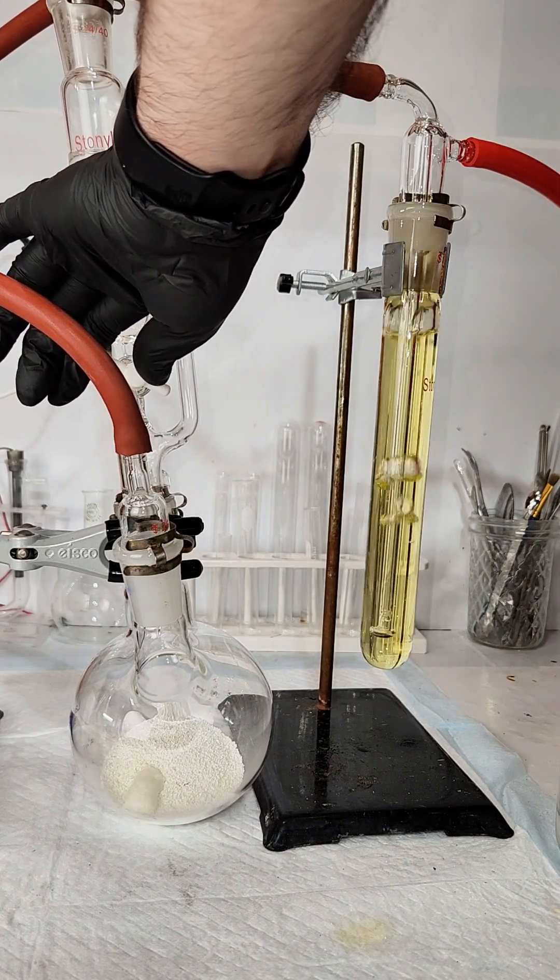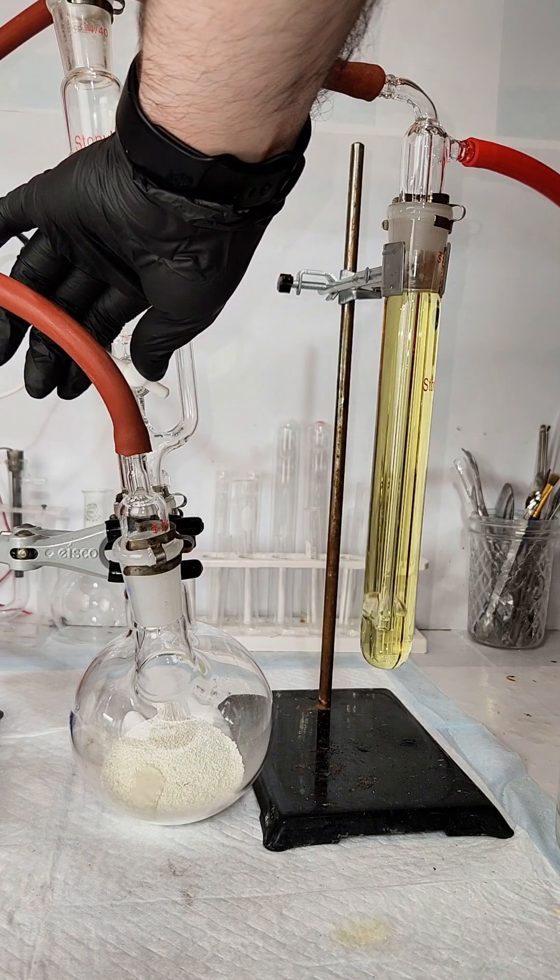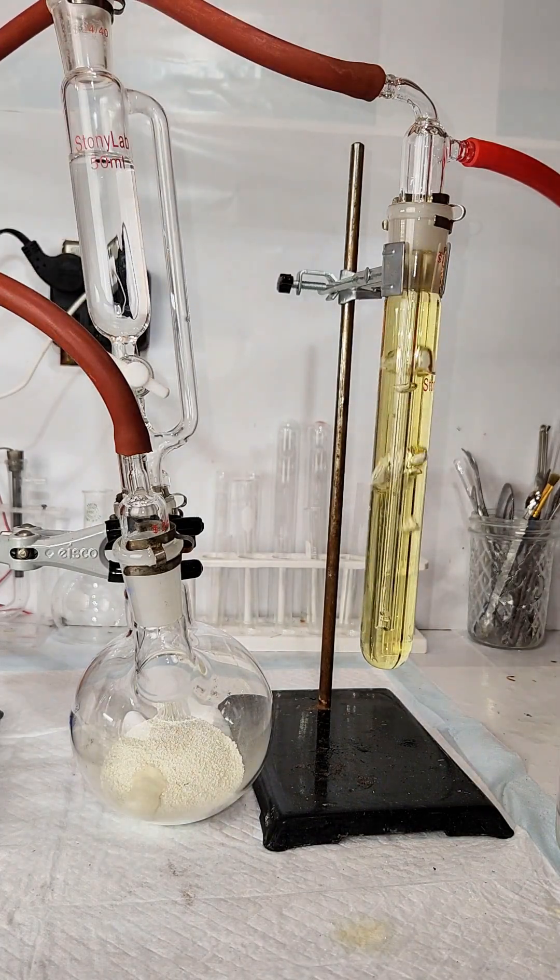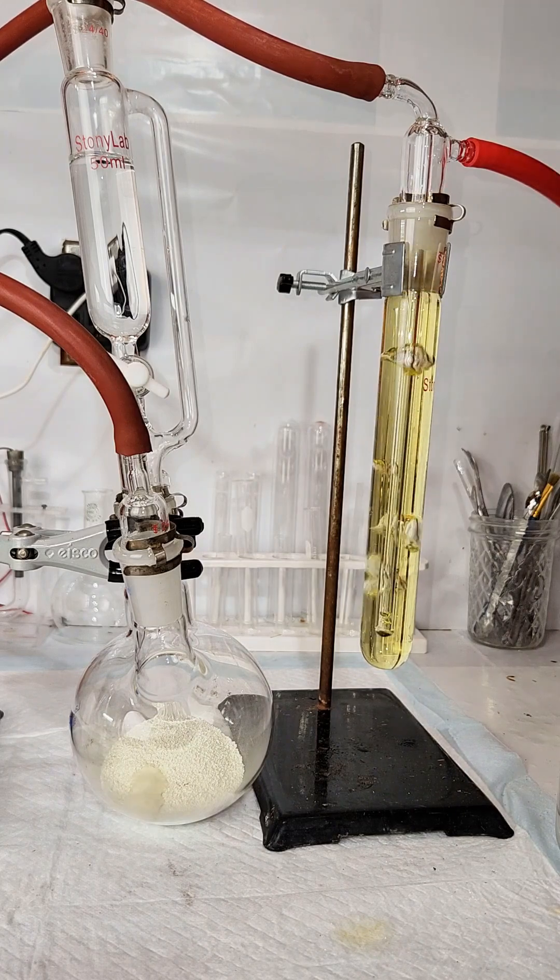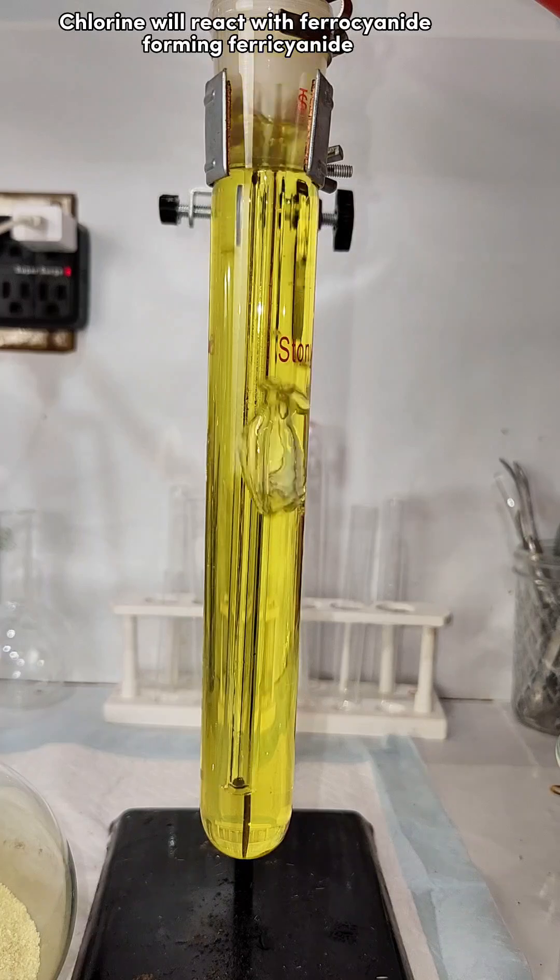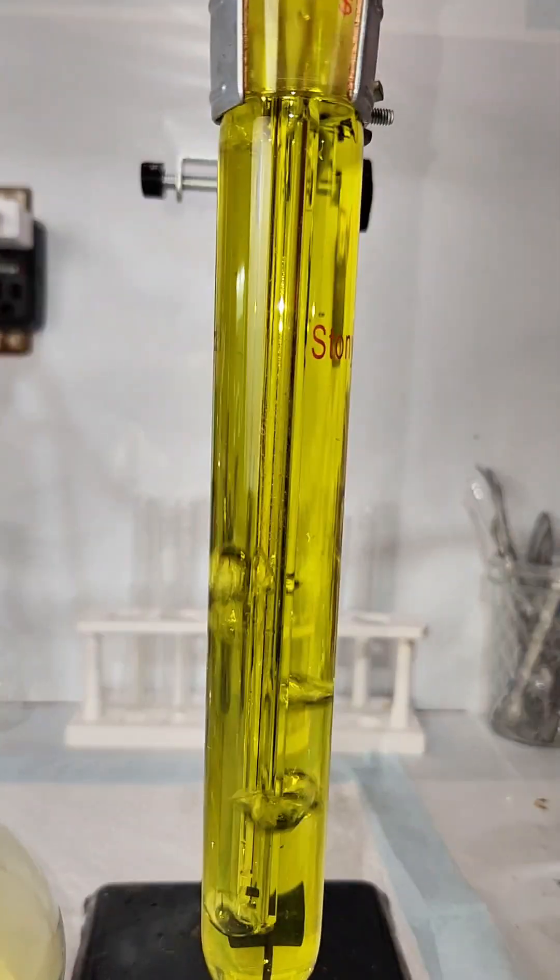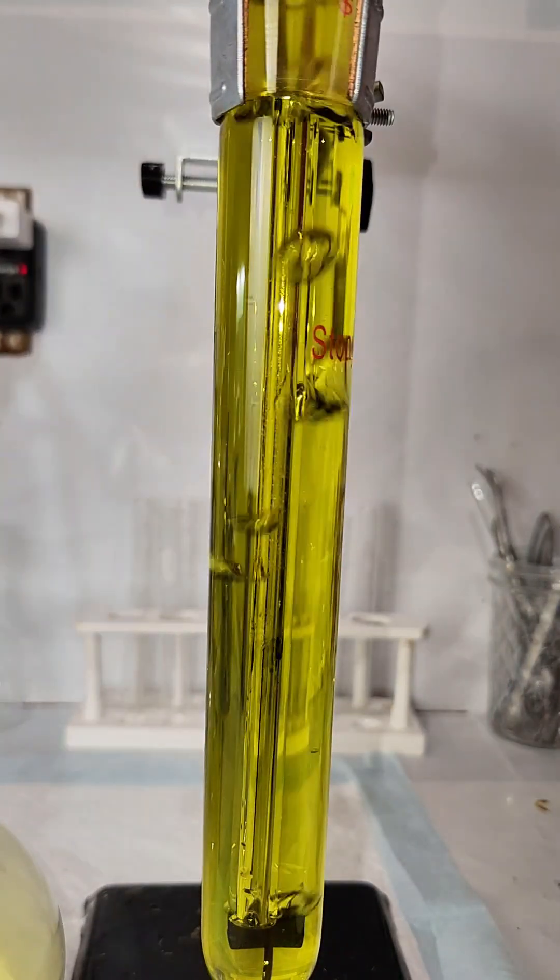The chlorine gas is fed by a tube into my reaction vessel where it's bubbled through the potassium ferrocyanide solution. The chlorine gas will react with the potassium ferrocyanide, oxidizing it to potassium ferricyanide. This will also produce potassium chloride as a byproduct. You can actually see this reaction happen in real time as the solution darkens.